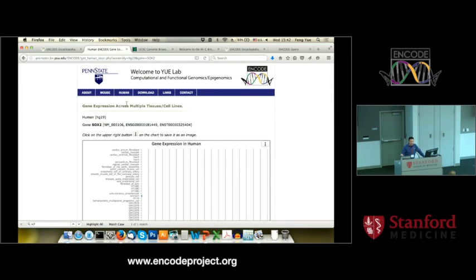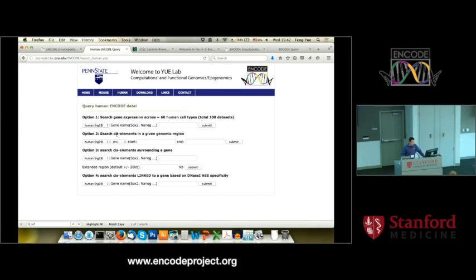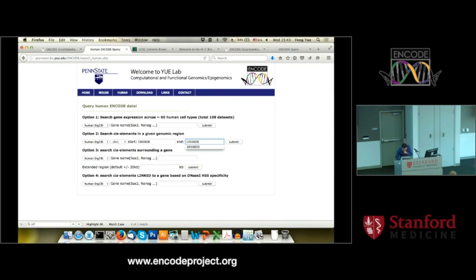So that's gene expression. Now say your PI comes back and asks: this gene is expressed in stem cells, but show me what TF or open chromatin regions are located nearby this gene or in a certain region. So you can go back to human, Option 2: search for a cis-element in a given region. You can try searching 100 million base pairs — please don't. Let's be civil. Let's try chromosome 1, 1 million to 1.5 million. Click Submit.